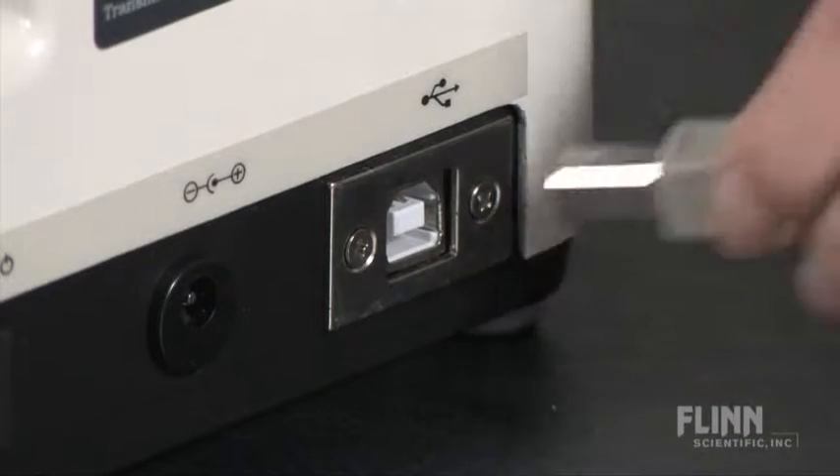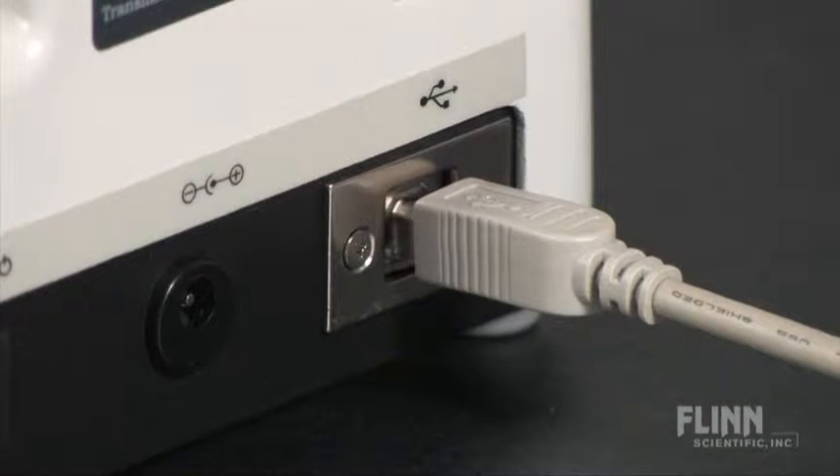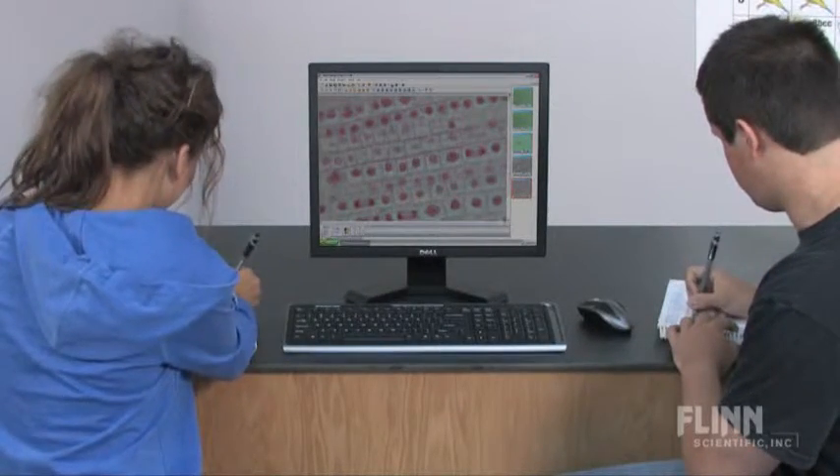Both scopes also use the versatile MODIC software platform to capture images and video when linked to a computer through a USB cable. Images and video can be shared so students can truly collaborate on their projects.